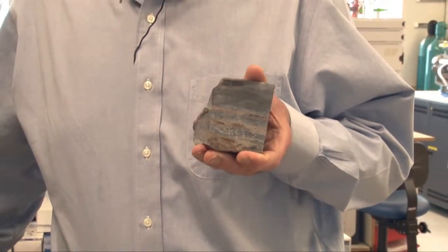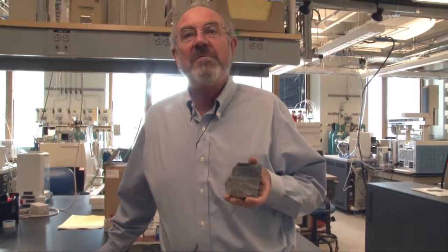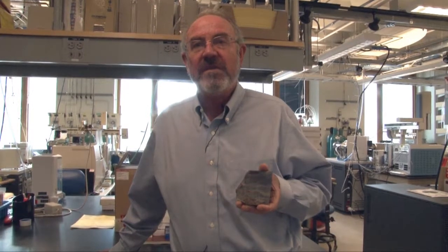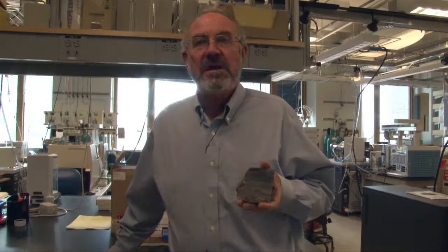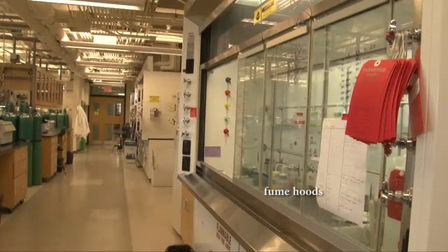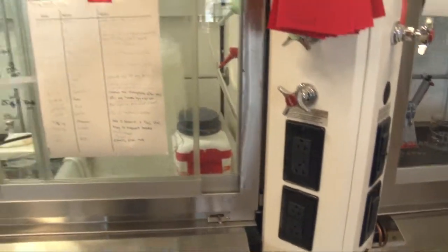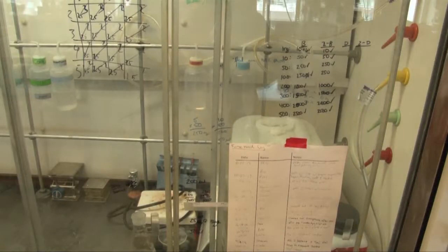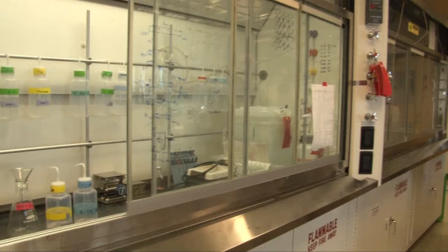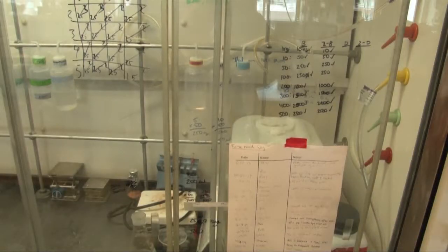What we're trying to do is extract chemicals from this rock that might support or disprove the idea that the objects that have been found are actually fossils. So we're focusing on chemistry. On the right side of the lab here, you see a row of fume hoods. Because we're handling hazardous chemicals, all the work with hazardous materials has to be done in these fume hoods. The fume hoods are allocated to different purposes. Some things we do very clean work, or we try to do clean work, and some of the hoods have acids, very strong acids, very dangerous. So we partition the different tasks to the different hoods.